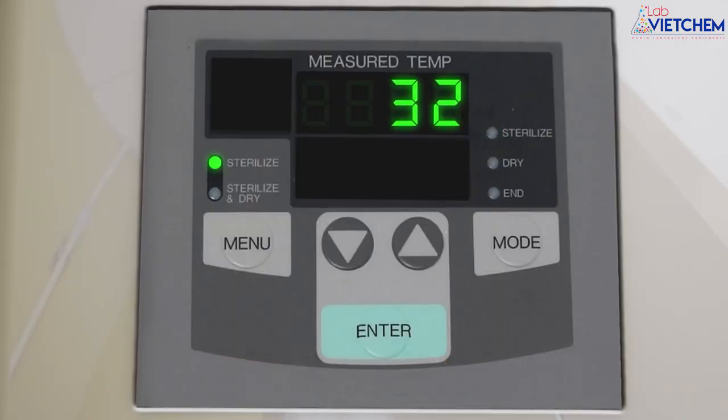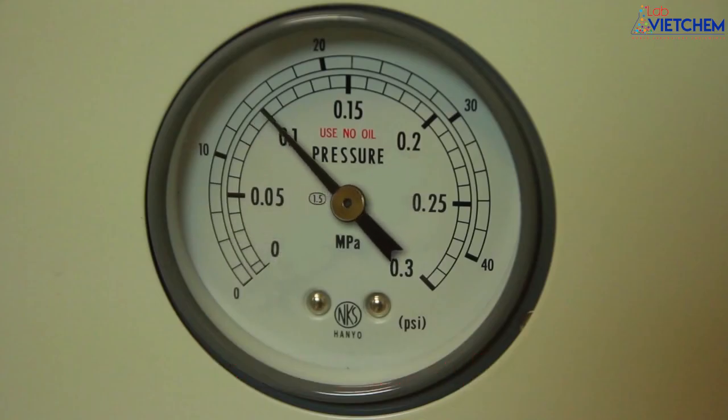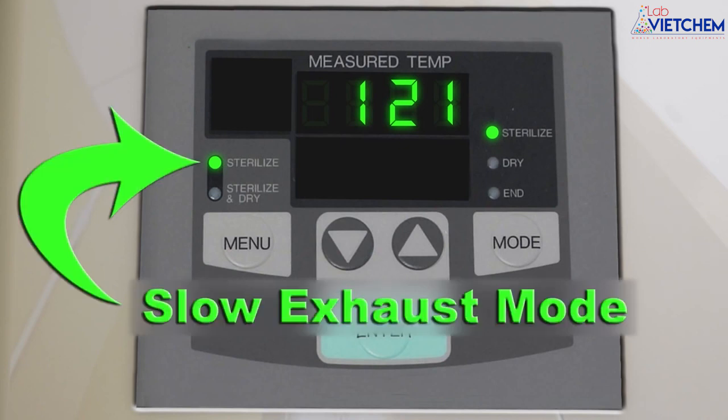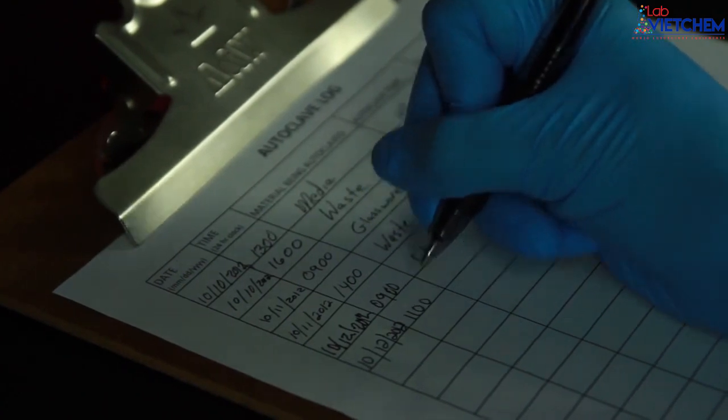Use the control panel to set the mode to sterilize, the temperature to 121 degrees celsius, and the pressure to 15 psi. The slow exhaust mode prevents the liquid from boiling over and out of the flask. Run the autoclave for at least 15 minutes.